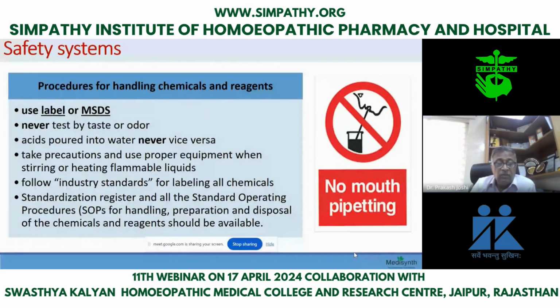It is not your home where you are testing whether it is salt or sugar, or haldi or mirchi. Nothing like that. Here, you never know which chemical is very hazardous. So don't have a habit of tasting. And always pour acid into water, never vice versa. If you put acid in the water, it gets diluted. But if you put water into the acid, you can see what will happen. A lot of gases will be there.